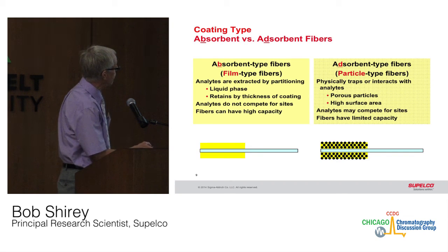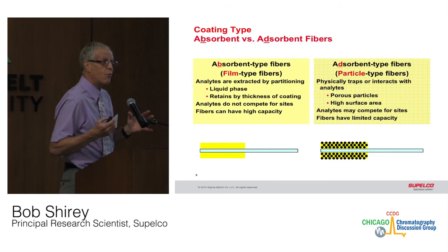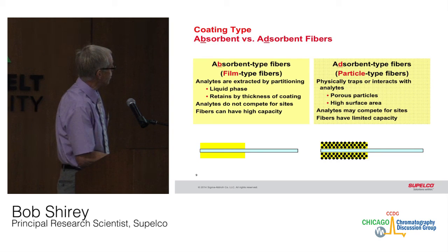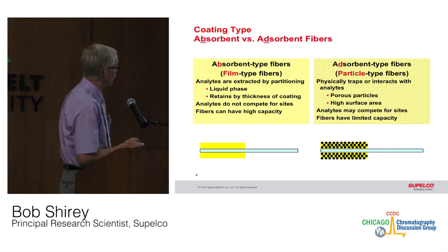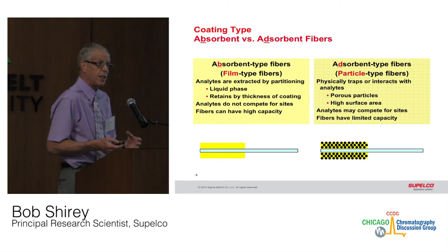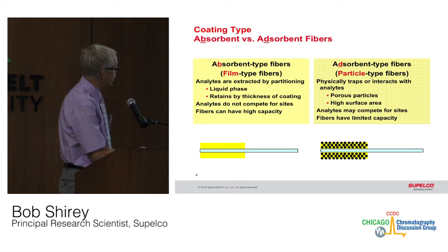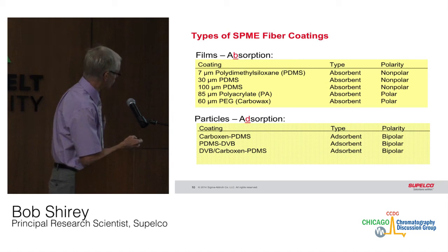Now, the adsorbent type of fibers have particles embedded into the phase that physically trap or interact with the components. That's either by the analytes going into the pores, or interacting with the surface area of the particles. There may be some competition for these sites, depending upon the affinity of the analytes for that surface interaction and how strongly it's retained. As a result, these fibers tend to have less capacity than the absorbent type fibers.